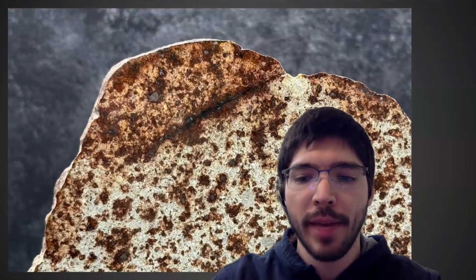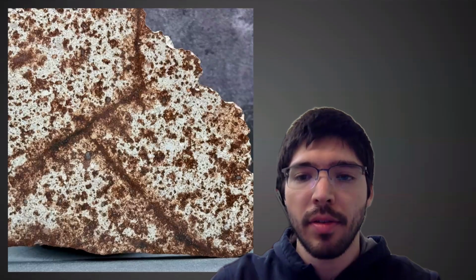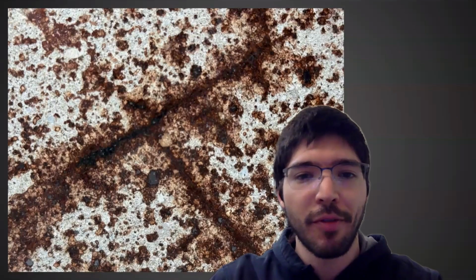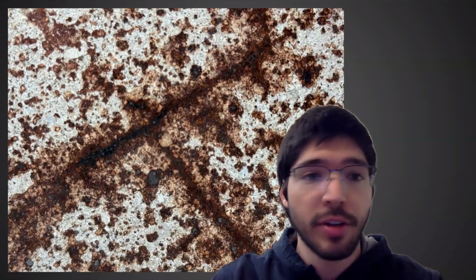And then probably at the end, we'll navigate between the submission form, the data sheet, and also the form that has the history information. And of course, if anyone wants to add anything into the physical characteristics of the specimen, like from what we're seeing from all the samples and the images that Topher is showing, feel free to do so.